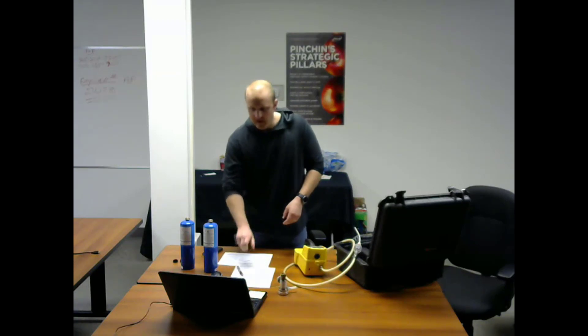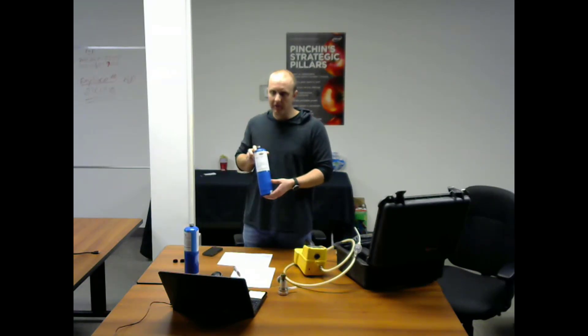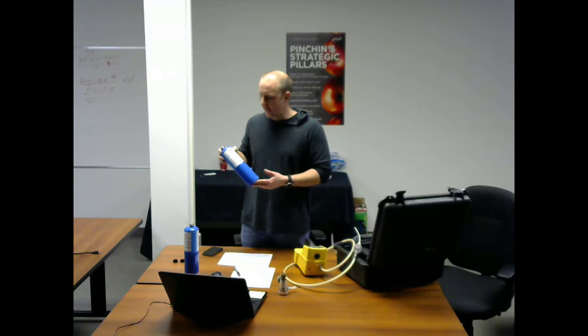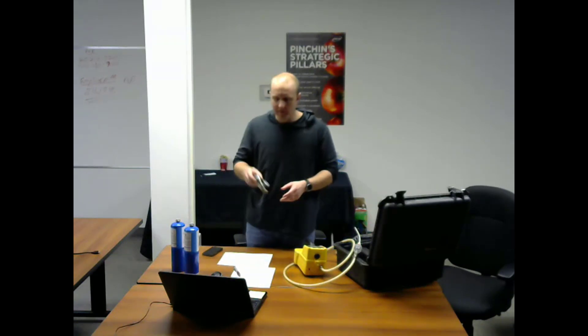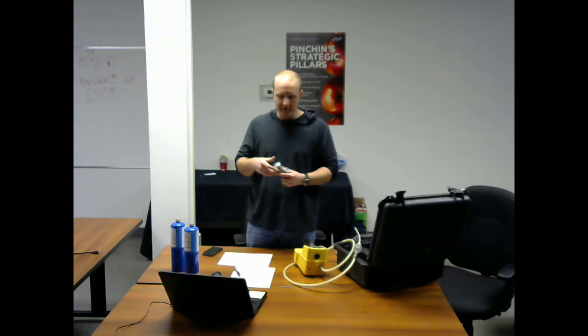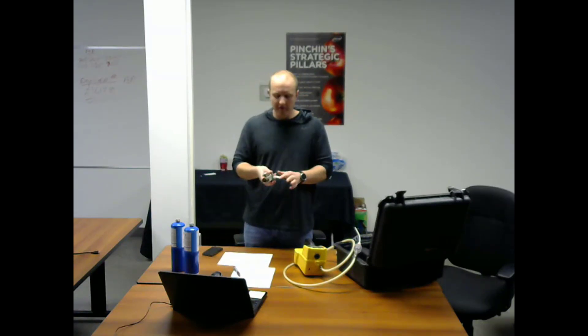And you need to have your calibration gases. This one here is for hexane and it's your LEL gas at 15%, and this one here is your isobutylene gas at 100 parts per million. This is your one-way valve — make sure you have this as well, as it will help you attach your instrument to your gases to take your readings. And you need a little piece of neoprene too.